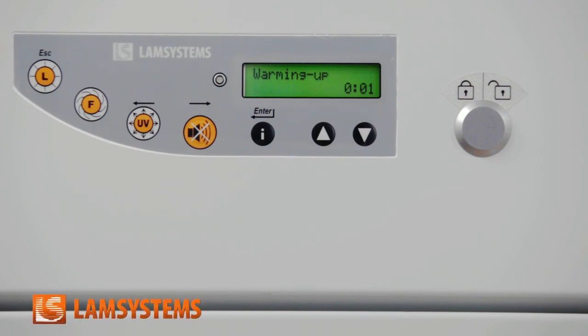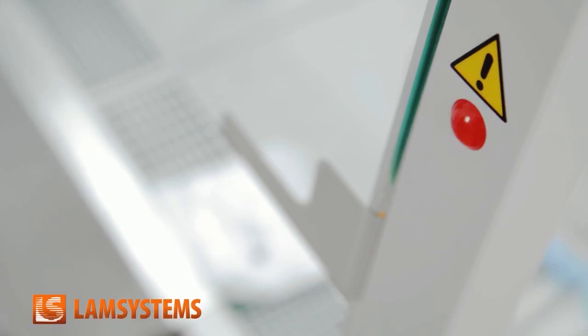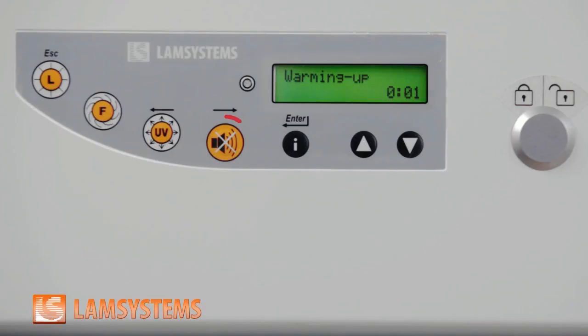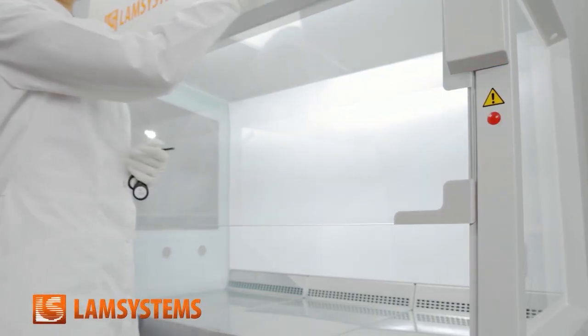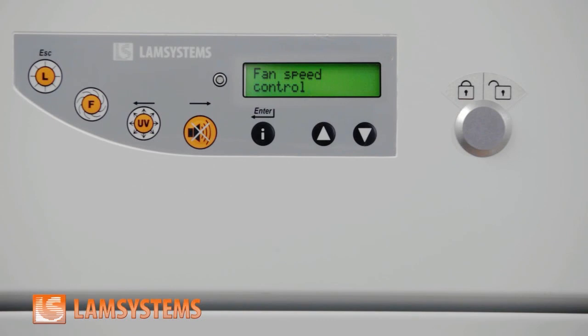During this period, the following processes are on: control system, primary heating, airflow sensor calibration, fan adjustment. The audio-visual alarm system is also on. You can turn off the sound to avoid discomfort. The flashing red light warns the operator that it is impossible to start work until all cabinet characteristics reach the specified parameters. When the cabinet is ready for the operating mode, the light turns green. You can start work.